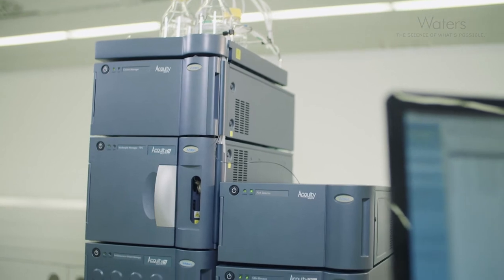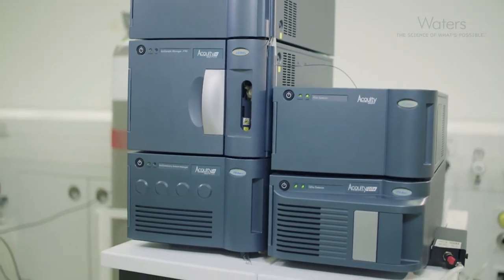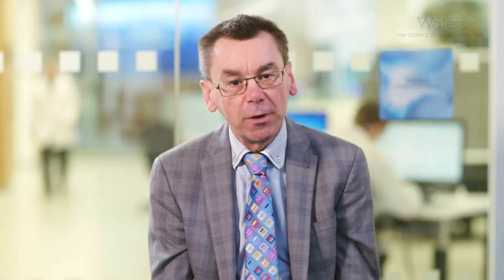The Acuity QDA can be added to your existing Waters instrumentation, and it can obviously be purchased with new systems. But we know it will increase the confidence in the results that you are generating.